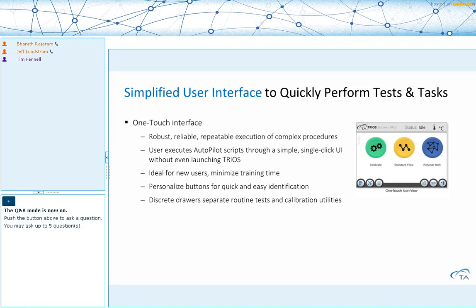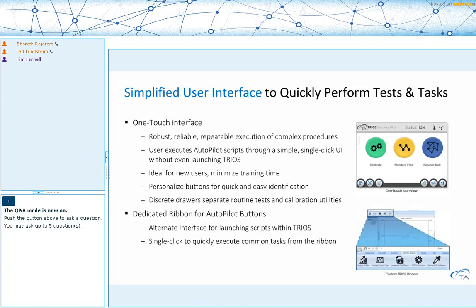So when we start, we always give an overview of what the script does and what geometries are required. We can then have built-in checks for instrument calibration as well. If it's within a specified range, we can continue. Otherwise, we can prompt for calibration. And then we can set the test temperature, followed by geometry calibration. And this here is demonstrating a case where we use the timer to tell the user where we are with the geometry calibration process.